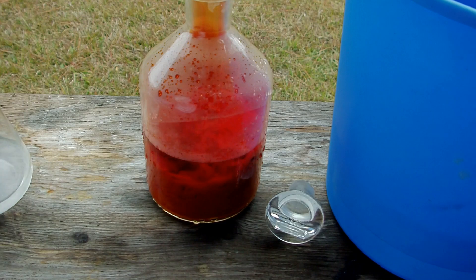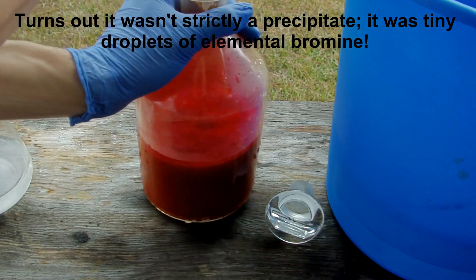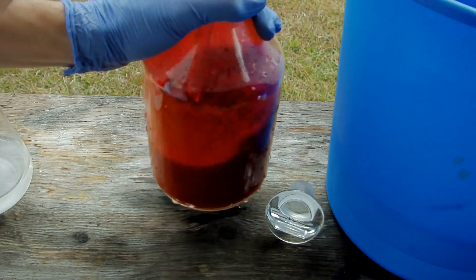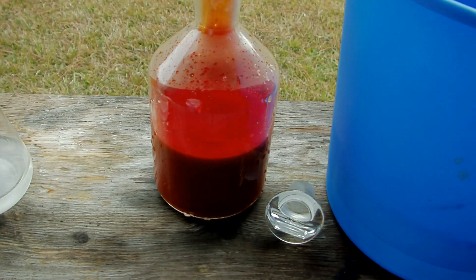That's kind of cool — some kind of precipitate. Let's swirl it around a bit.